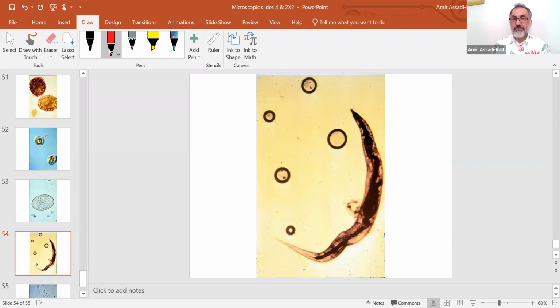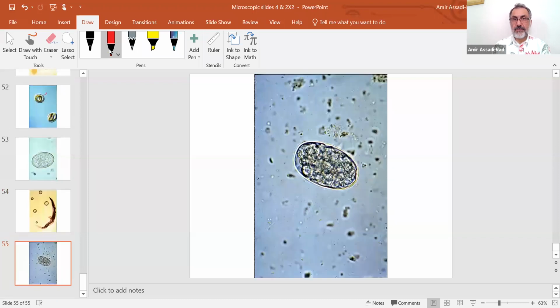Pinworm again. So many times pinworm came. I want to say vermicularis. I can't remember the first name. Anyhow. Okay. Hookworm, Ancylostoma. Okay, so we are done with the slides.